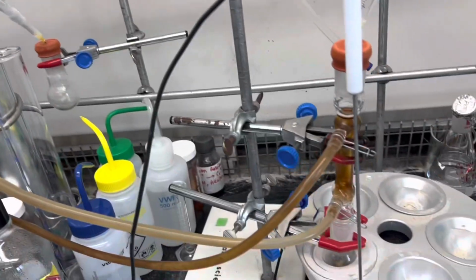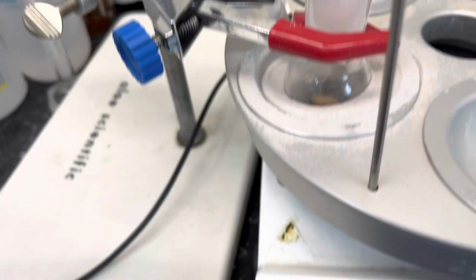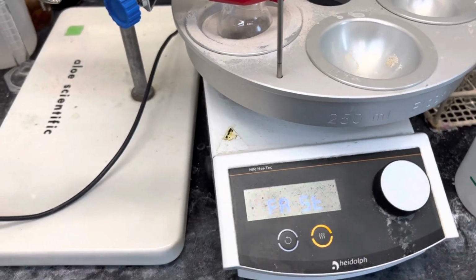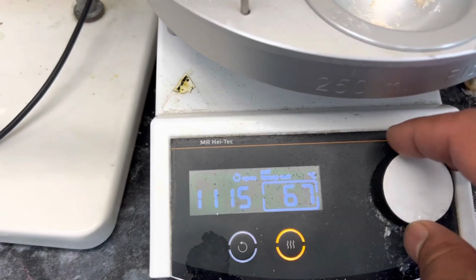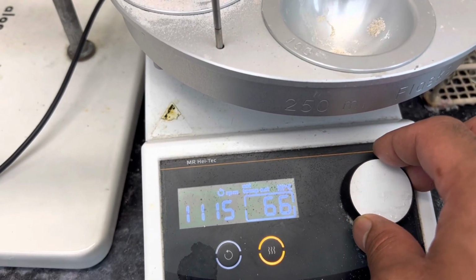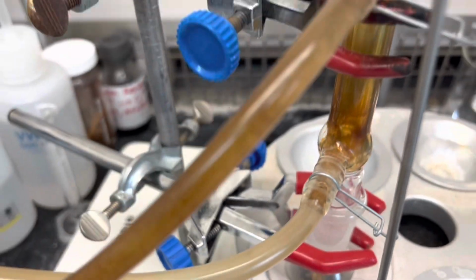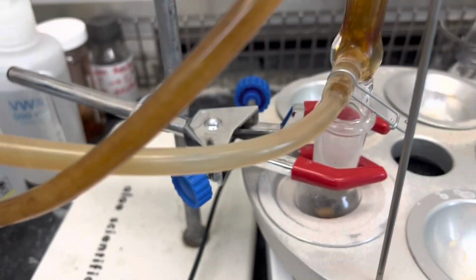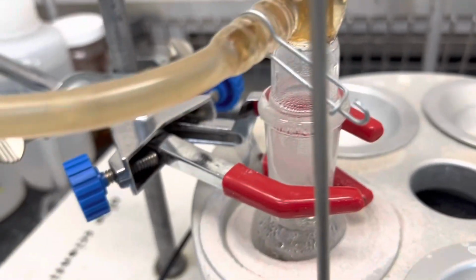This reaction is under nitrogen, since it is a reduction reaction. So I degassed, and then I started under nitrogen, and I closed the nitrogen, but I kept the nitrogen line on so that the built-up pressure can go through. Now I'm fixing the temperature, so it should be 65 degrees Celsius. Now everything is ready. I turn on the water. Make sure that you turn on water with the condenser. So the reaction setup is done. Now I'm waiting for 65 degrees Celsius. Here you can see that the methanol is refluxing at 65 degrees Celsius.